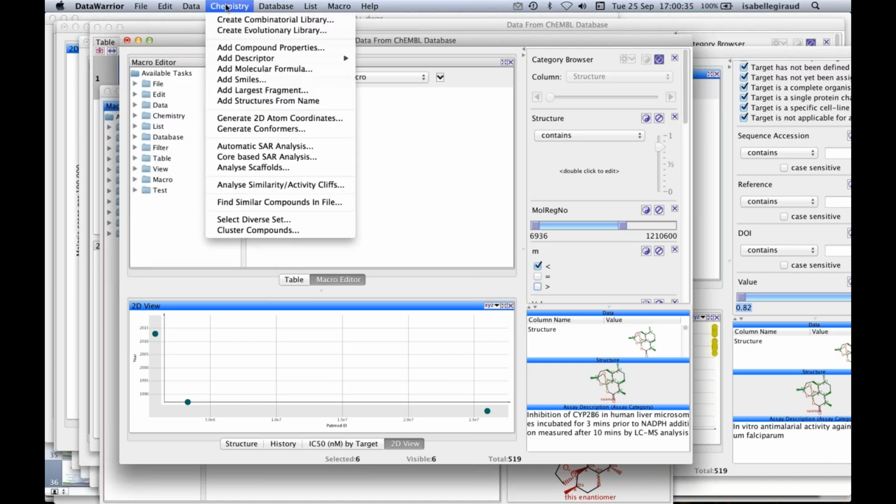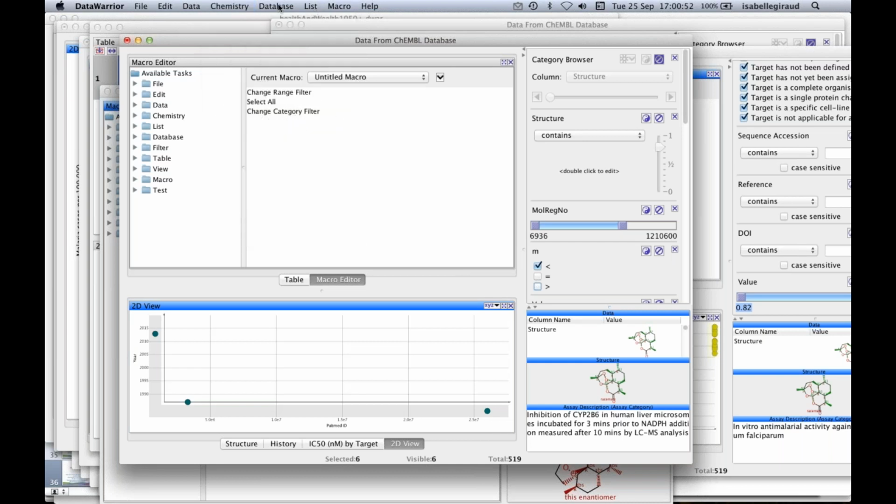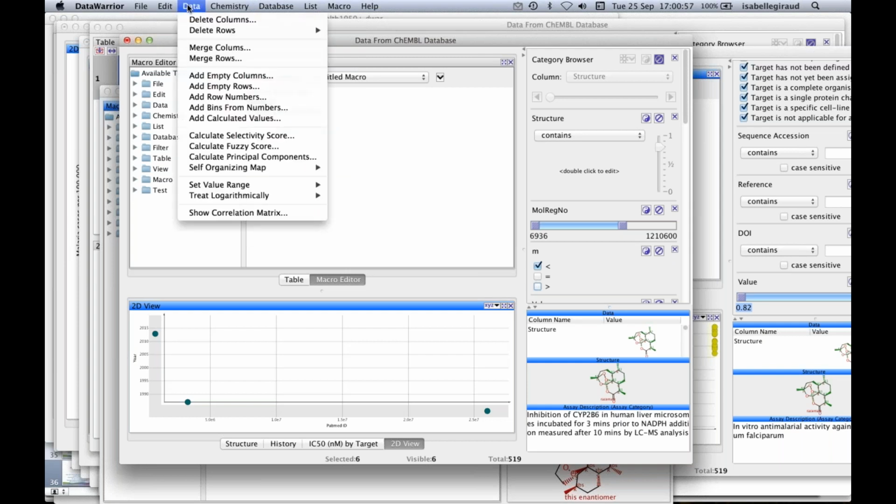We have a new point concerning the reactions, to search reactions, with many different tools for the reactions. This is now coming. There is also a possibility to split the cells, but this is only for data coming from our database, so that's not for the open source version.